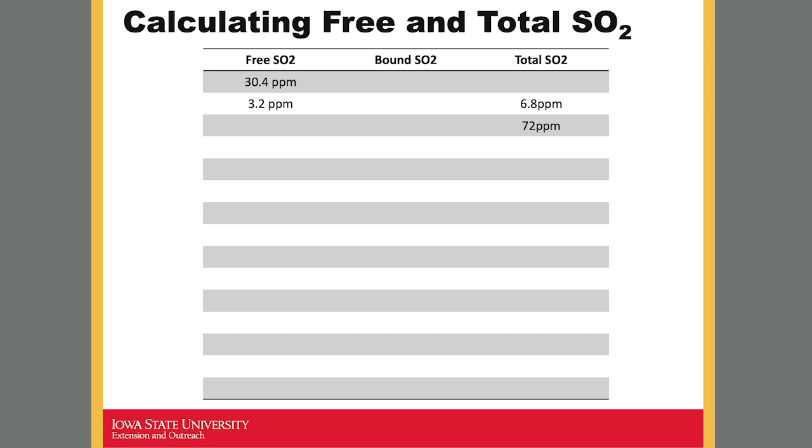So it's time consuming. It's not really time efficient. Also, another con would be the flow rate. You need a flow rate that is really specific and precise. You need a flow rate of 1 liter per minute of airflow. But if you don't have that airflow, you're going to have some fluctuation of the reaction, and that won't be really accurate. So you always need to make sure you have everything done correctly.